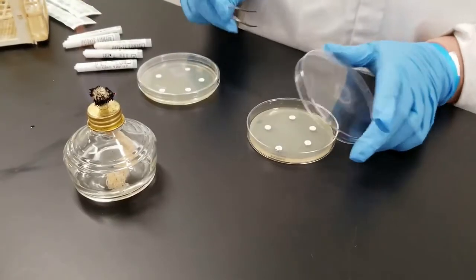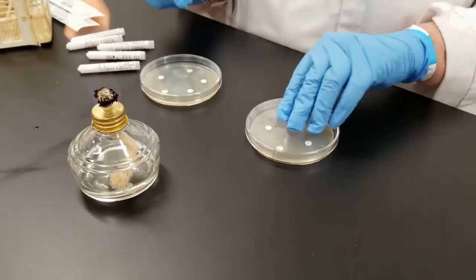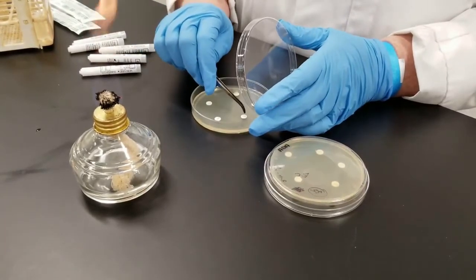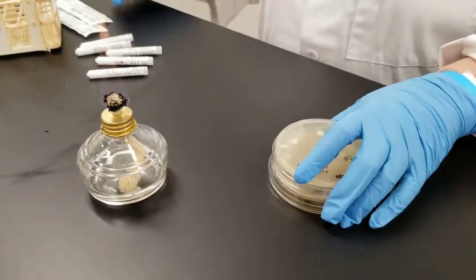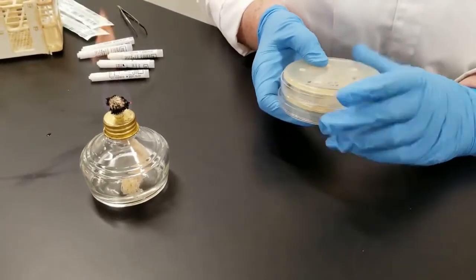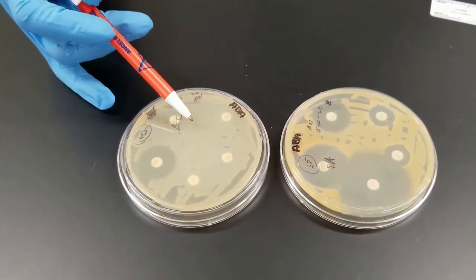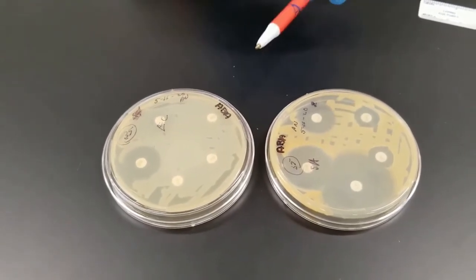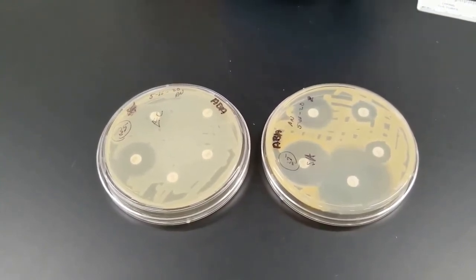Okay, so now that we have all the discs on here, you might want to just gently tap so when you invert the plate, they don't fall off. And then we will incubate these. When we check on them afterwards, we will see the effects of the various antibiotics on the two different organisms. We'll incubate this at 37 degrees. The two plates we have here, this one over here is E. coli, which is gram-negative, and over here we have Staphylococcus aureus, which is a gram-positive. So you're going to see the differences between gram-positive and gram-negative and how effective the antibiotics are.